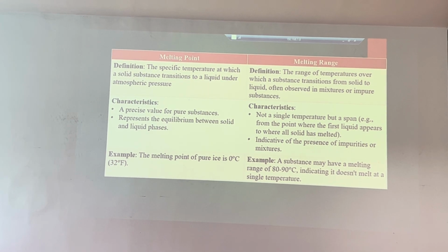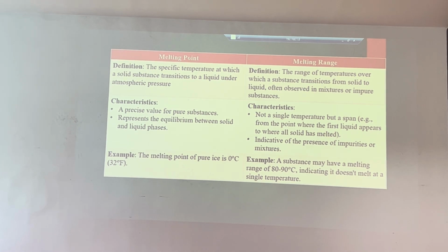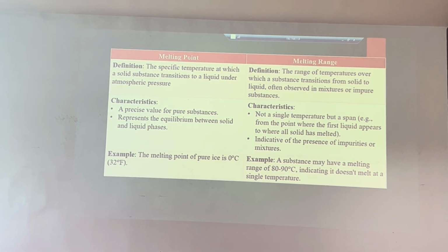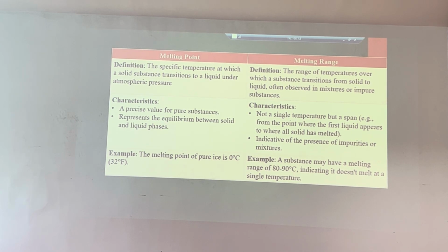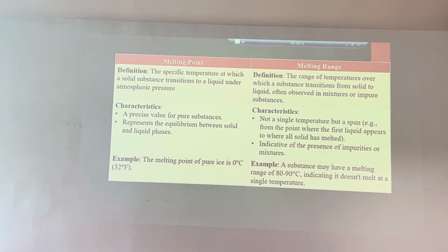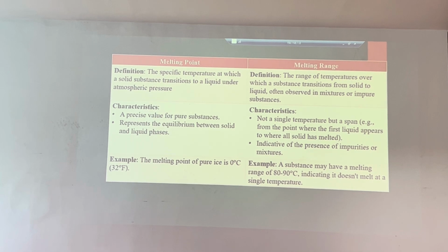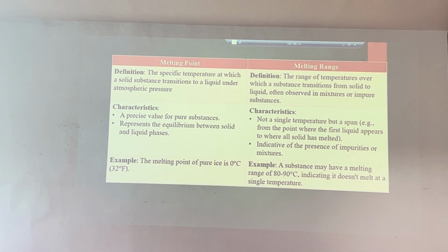Whereas for the melting range, whenever the solid starts melting, for example, if you are taking 4 mg or 3 mg of substance and you keep it in the melting point apparatus, the solid will start melting, and that is the starting point. At the end, the solid is completely converted to liquid. So the in-between range you can call a melting range, in the simplest way. Next.